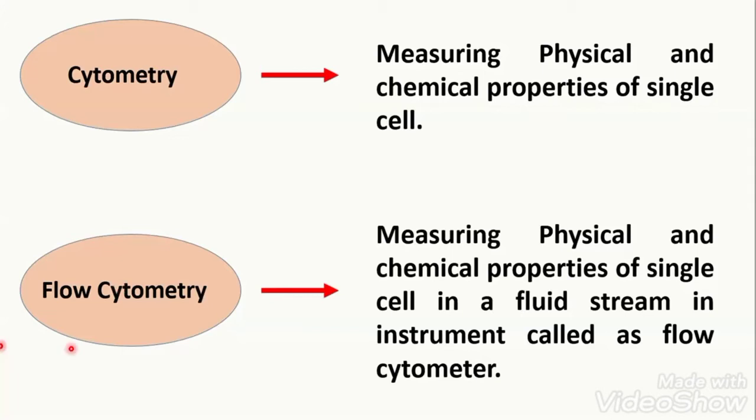We are doing the same thing. We are measuring the physical property. We are measuring the chemical properties of a single cell in an instrument which is using the flow of a fluid. A fluid stream is being utilized to understand the physical property and chemical property of that particular cell.